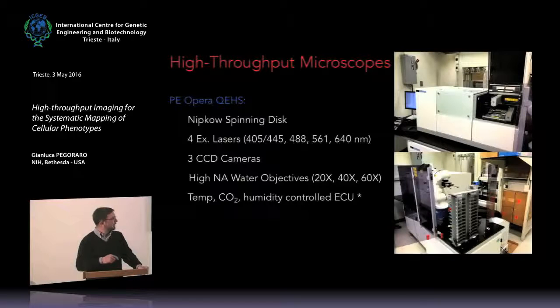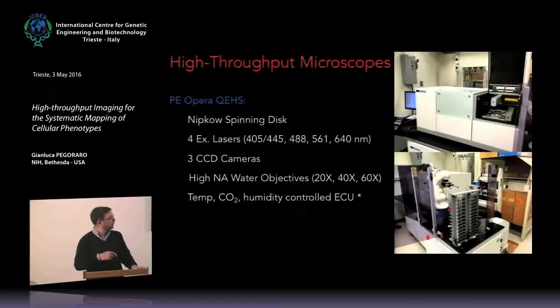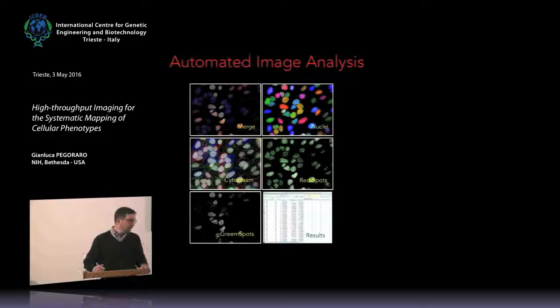And just as a side note, I didn't mention this, but we can image multiple plates in a screening campaign, so a lot of screening facilities are actually equipped with robotic automation equipment to automatically load and unload plates in and out of the instruments to increase the throughput. So I mentioned that the number of images generated on a per day basis can be in the order of hundreds of thousands. So manually analyzing the images is impractical, if not impossible.